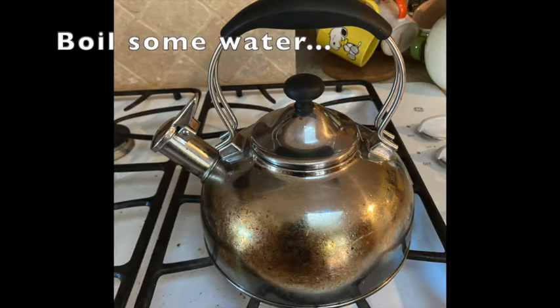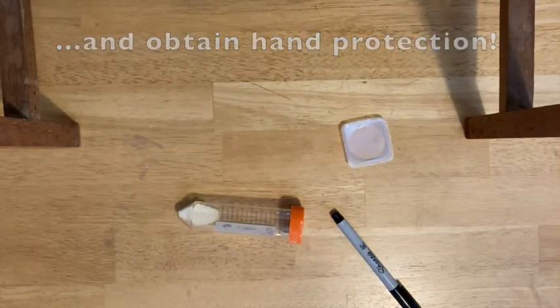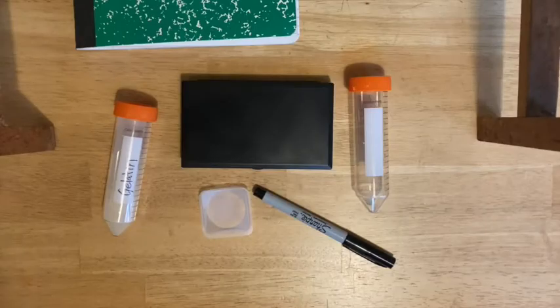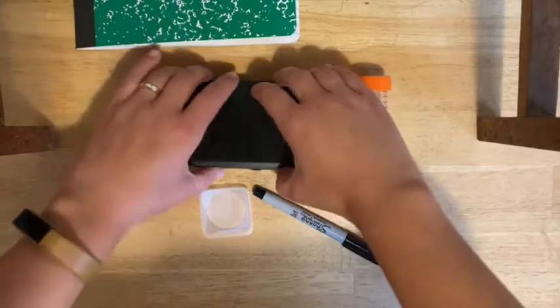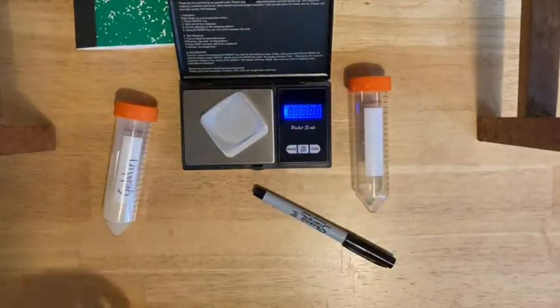The next step is to make some gelatin. This is going to be the substance that you will use to test whether or not your bromelain is active. Meanwhile, you want to be boiling some water. You'll also want to make sure that you get some hand protection, so pot holders or something like that. And then you're going to weigh out the correct amount of gelatin. Make sure you zero the balance with the weigh boat on there.